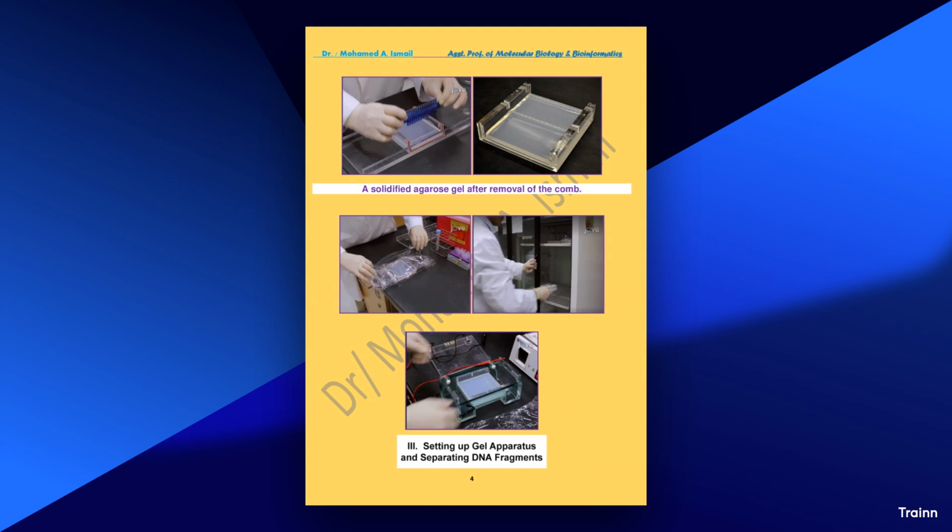1. Errors in gel preparation. A. Incorrect agarose concentration. Error: using an inappropriate agarose concentration can lead to poor resolution of DNA fragments. Impact: too low a concentration may not adequately separate small fragments, while too high a concentration can hinder the migration of larger fragments. Solution: choose the agarose concentration based on the expected size range of the PCR products, e.g., 0.7% for large fragments, 2% for small fragments.